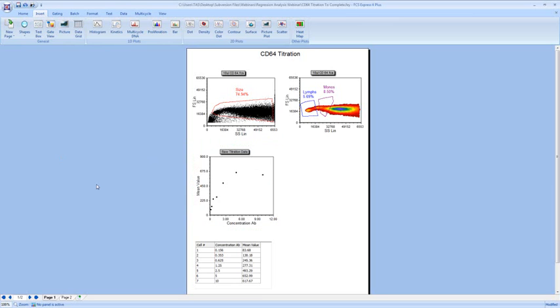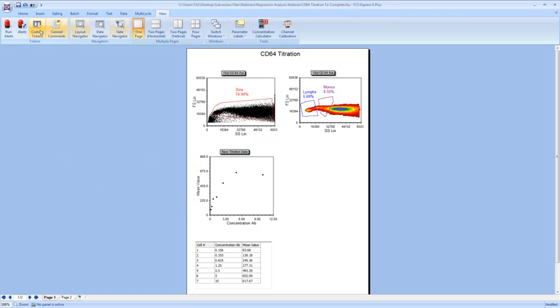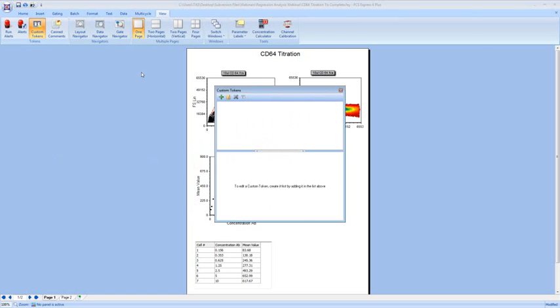So at this point, we've plotted the data. What we want to do is get the fit parameters out of this. We want to know what the equation for the line plotted in this is. To do that, we're going to insert a custom token. So we can go to View and Custom Tokens, and let's move this to the side.